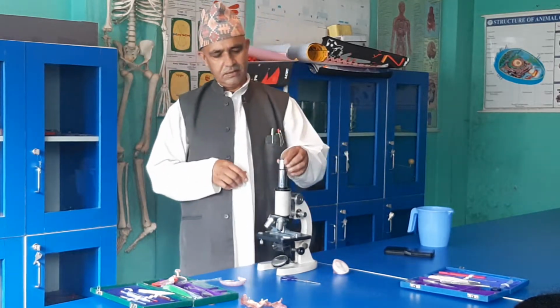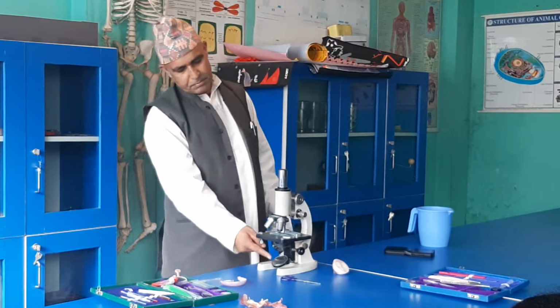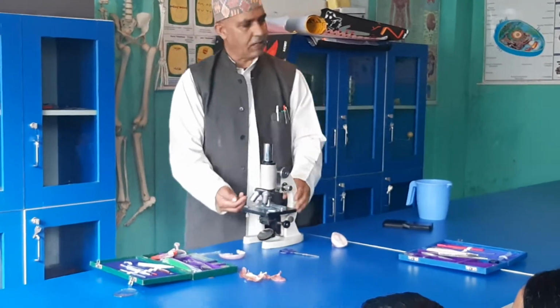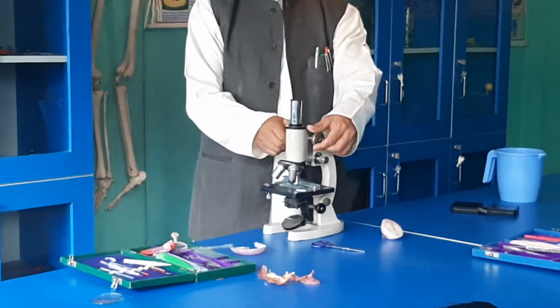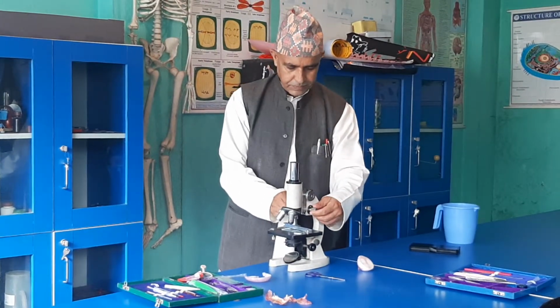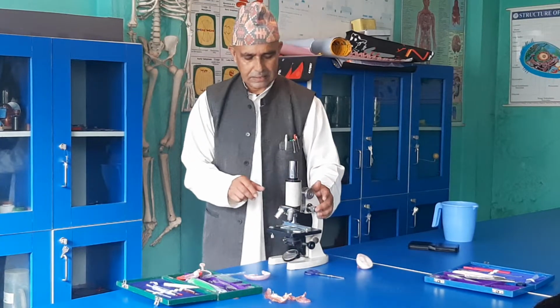Okay, let me place it here. And the object is kept in that slide. And here you can see the reflector. What is here? Down here is one mirror. Can you see? Yes, yes. Reflector, its main duty is to reflect the light so that we can view it clearly. And up, down, yeah, it is called adjuster. It can adjust up and down. Its duty is to refine the image. Refine means make it clear, right?